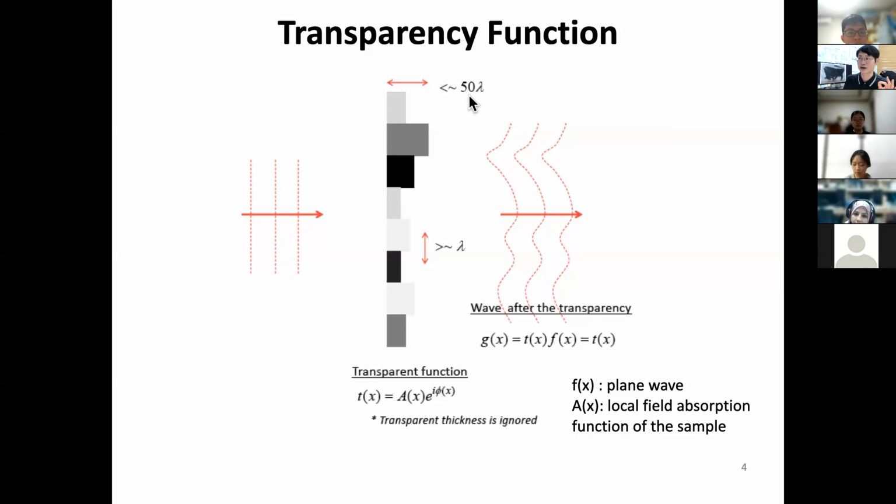You can see this will be less than about 25 micron. If you consider a single cell, the cell body is about 10 micron or so. So even if there is a monolayer of cells, this would completely satisfy that. And the lateral dimension, which looks like a pixel, will be similar to or bigger than lambda.